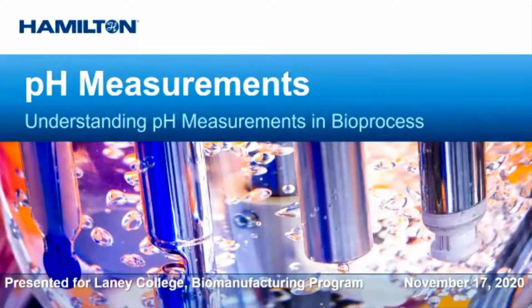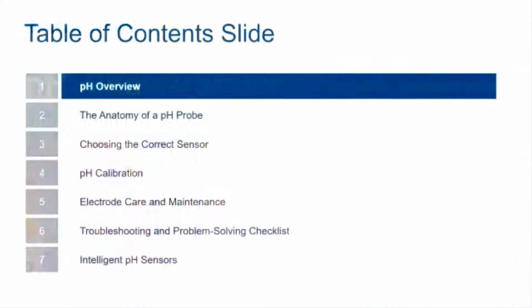We're going to be talking about pH and understanding what pH is all about when it comes to bioprocess. We're going to go over an overview of pH as a whole, and then talk about the anatomy of a probe, how to choose a correct sensor for your process, calibration, some care and maintenance, troubleshooting, and then if we have a little extra time at the end, instead of doing questions, we may talk about some intelligent pH sensors. Just depends on how many questions you guys have throughout.